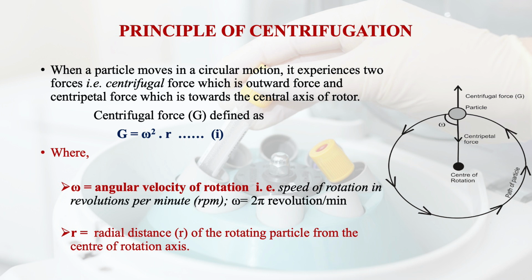center of the rotation axis. You can see in the slide that when a particle rotates in a circular direction, it creates an angle, which is the angular velocity, and the distance between the particle and the axis of rotation is defined as r, the radial distance. So the centrifugal force is an outward force which pulls the large dense particles for sedimentation of the molecules.